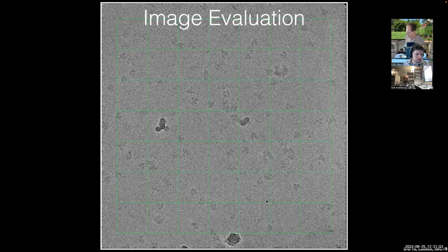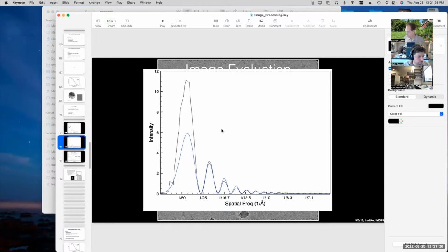So there's this big disconnect now between what noise is in the mathematical derivation and what noise is in the actual image data. So from the perspective of doing 3D reconstructions, the noise is anything that isn't the particle. And that stuff has structure because it's real stuff that's floating around in the ice. It's just real stuff that isn't the molecules of interest. So that's another source of noise that's present in the image data.